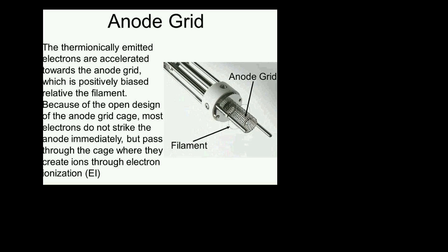The higher energy setting on the anode grid, on the other side, will give peaks that are wider, but they'll have more signal. They'll have higher amplitude. So they're the ones that you use when you need the maximum sensitivity out of the device. The anode grid, typically, there's not much you need to worry about other than it gets contaminated over time. And in some of the devices, you might have to choose whether you change the energy from high to low depending on what your application is.